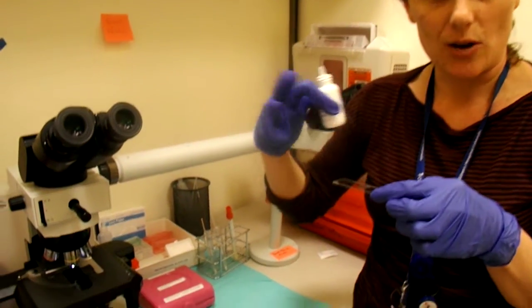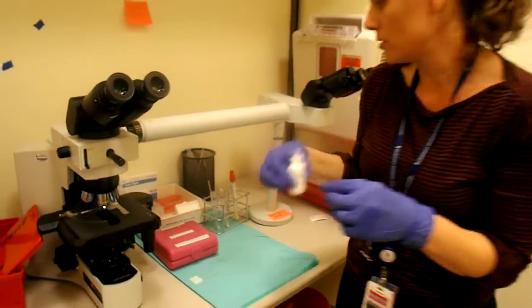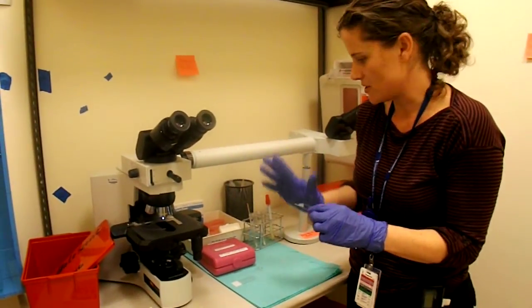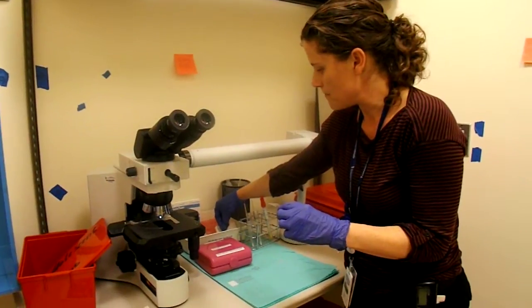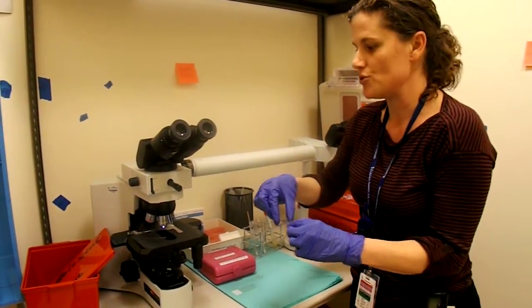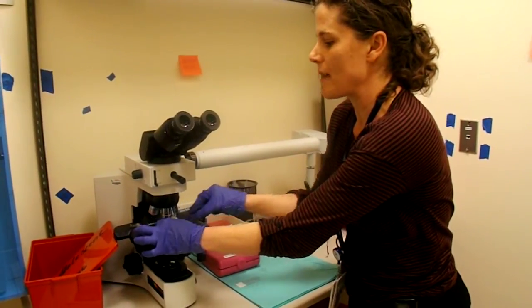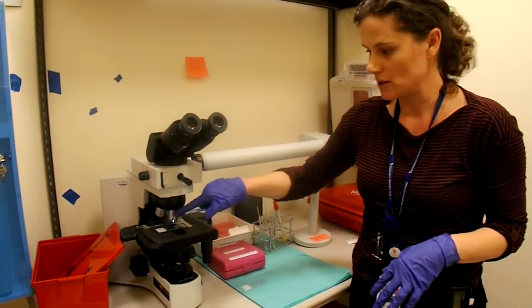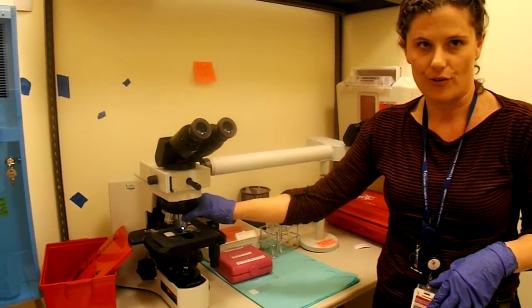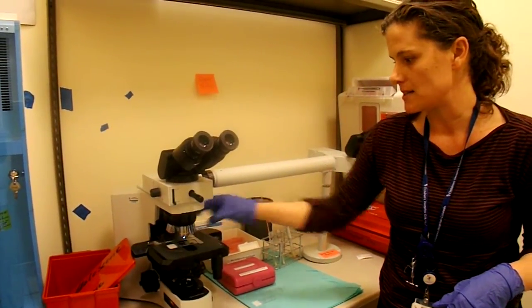That's where you wave and try to smell a fishy odor that could be indicative of bacterial vaginosis or trichomonas. And then you use the cover slip as well. And then you do the same thing: again, starting back on the yellow, the lower magnification, and going to the blue. And again, be very careful you're not hitting the slide with the lens.